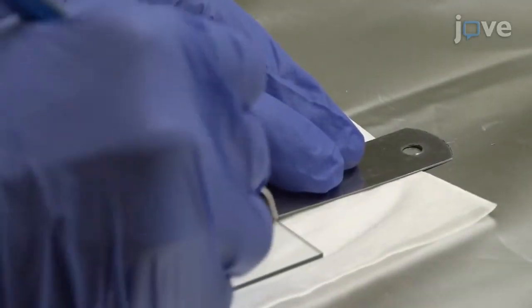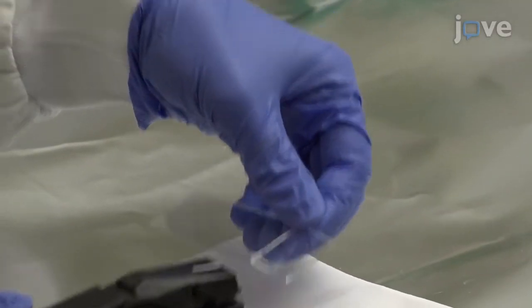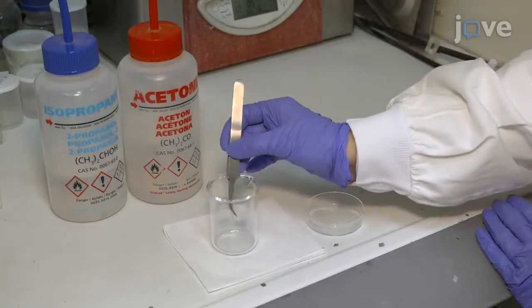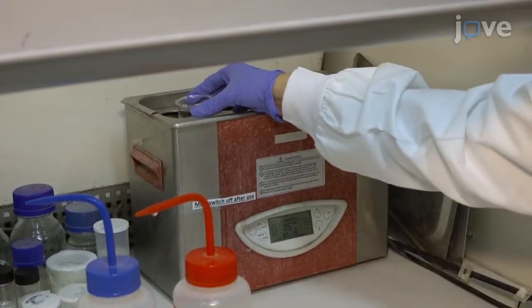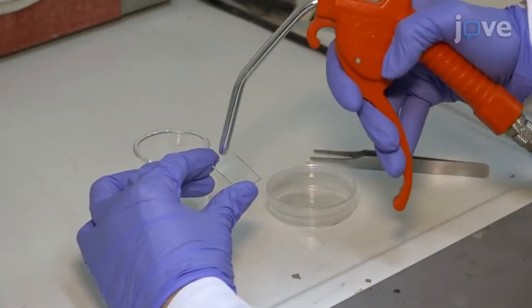To begin, cut glass slides into 2 by 2 centimeter pieces using a scriber pen. Clean the glass slides in acetone and then isopropanol for 5 minutes each in an ultrasonication bath. Then dry them with ultra-high purity nitrogen.